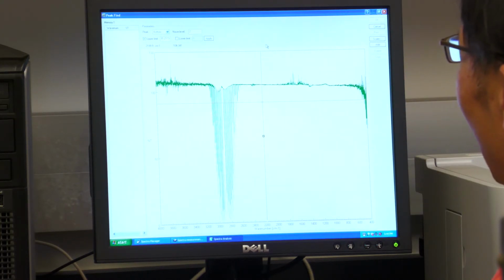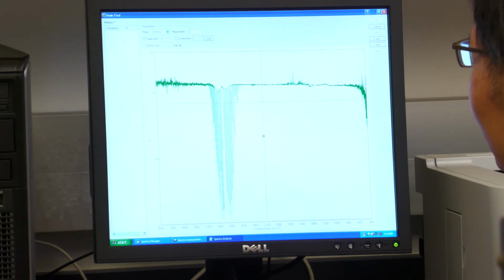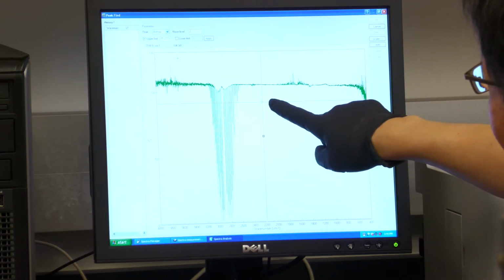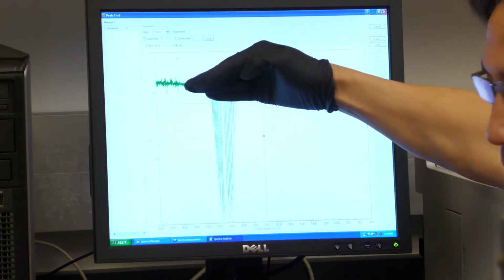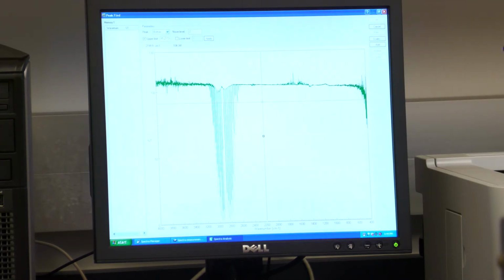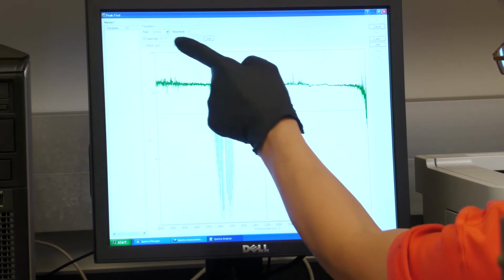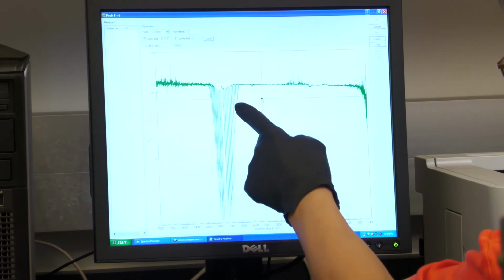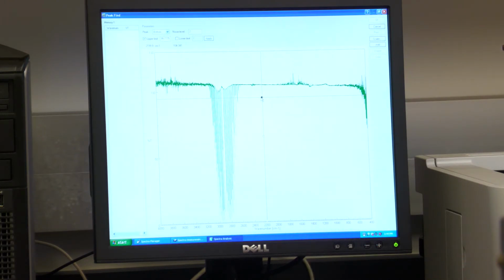So let's see the upper limit. The upper limit is here, okay? This one is for your upper limit. That means you cut everything above this line. So you can move this one. You can hold it here. Let's see. You can see when you move this one up and down, this changes, okay? How many peaks you include? Most of them is already enough, okay?